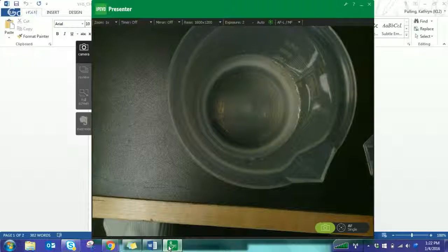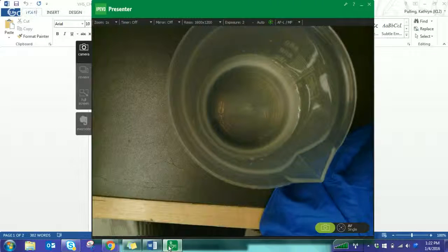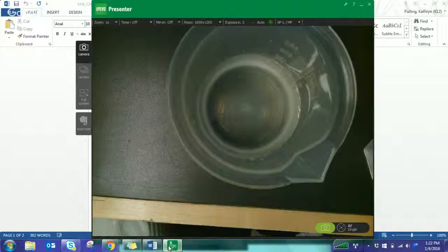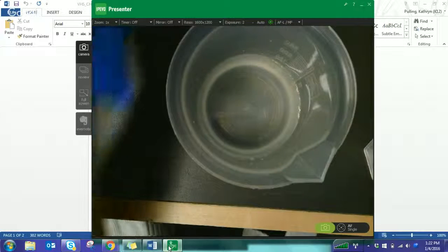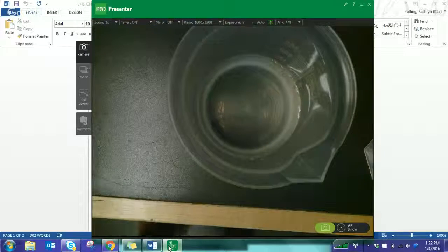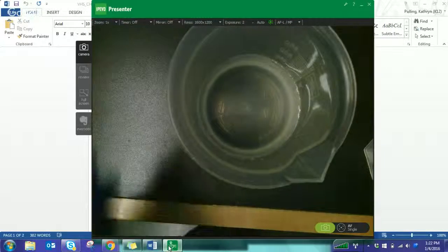There should be 20 milliliters total in the bottle, and I don't want to run out and not have anywhere near enough for part 2. All right, there's about 9. Looks like about half the bottle's left, so that's good. I should definitely have enough for part 2. Since we aren't going for stoichiometry here, using a little bit less than what it says isn't going to hurt anything, and we should still be able to see a reaction.